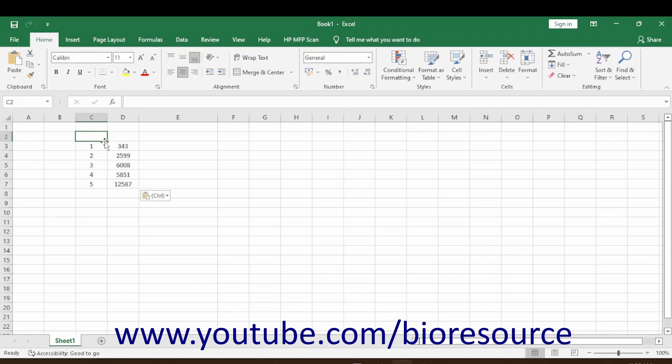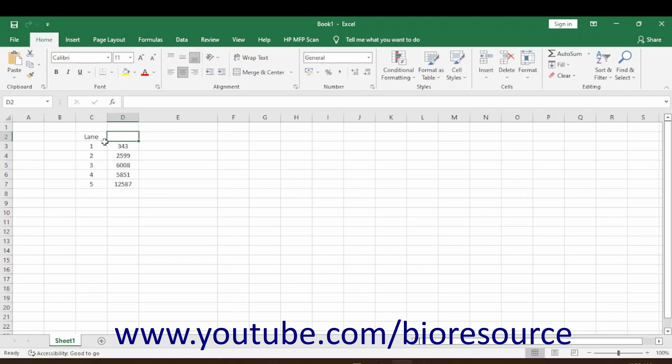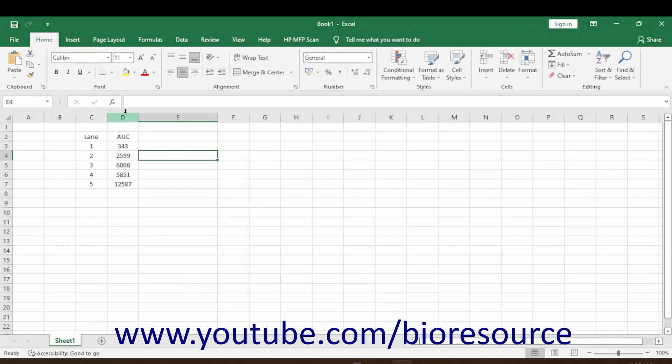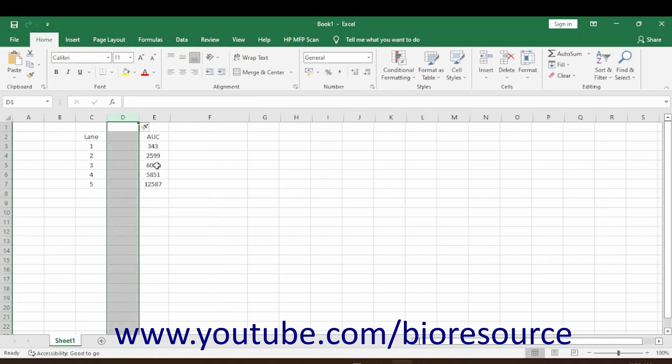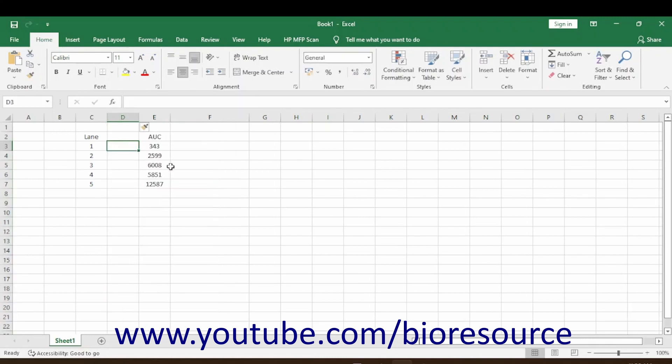In the Excel sheet, mark the columns as Lane and Area Under the Curve. You can also insert the sample names. The first lane is the control.